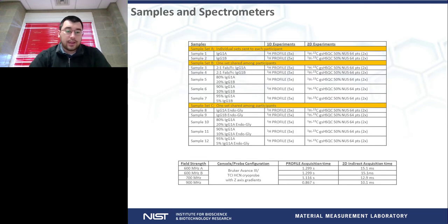So we took these 2 methods and we decided to run a multi-lab study in order to determine if these 2 methodologies, which have been published, are in fact comparable. And so as you can see here, there's a list of numerous blends of antibodies along with antibody types in which we can go through and actually do some comparability studies between the 1D method and the 2D method.